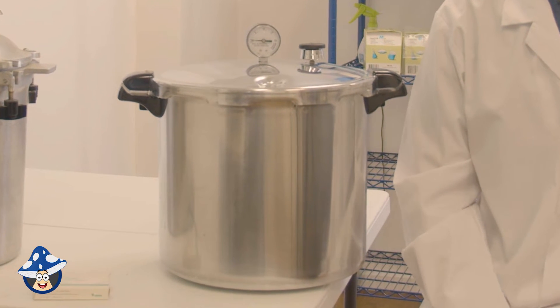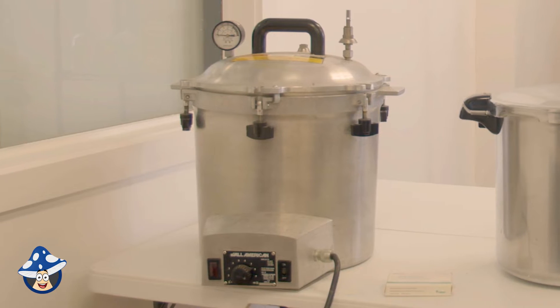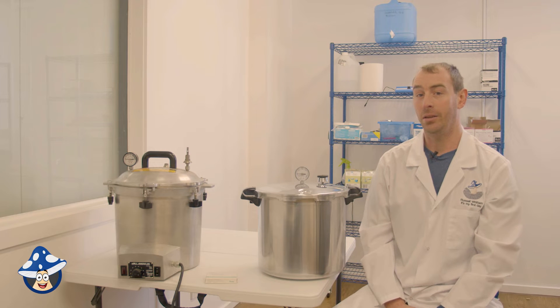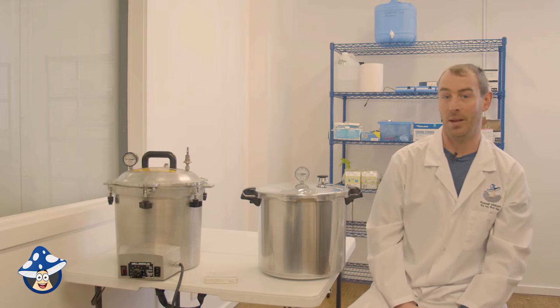The Presto comes in a 21-quart size. All-Americans come in sizes from 10-quart up to 41-quart, so you can fit quite a lot in there. An All-American sterilizer is an electric unit, so they're very handy to set up in your lab next to your flow hood — you're not moving between the kitchen and your lab space. They do cost a bit more but are definitely worth the investment.